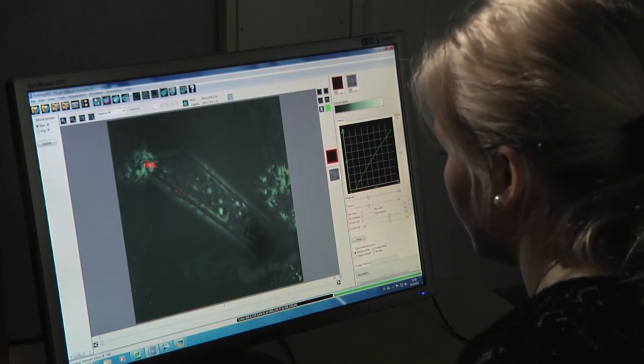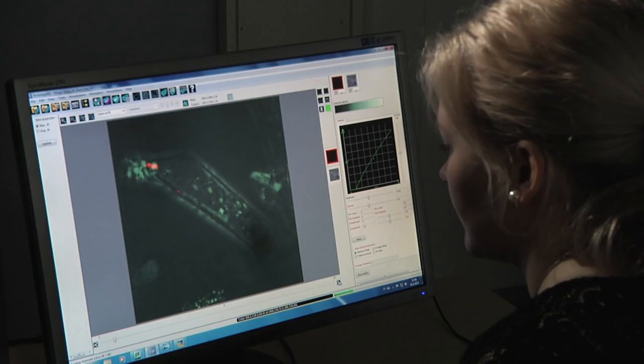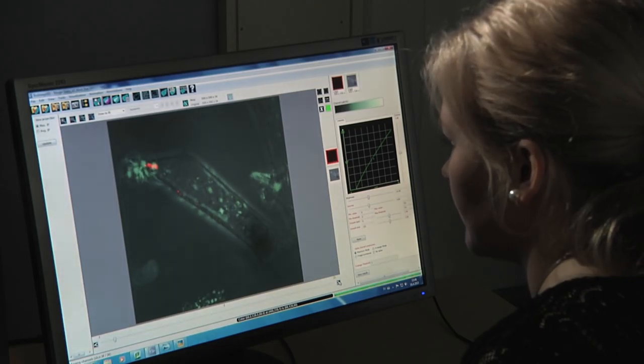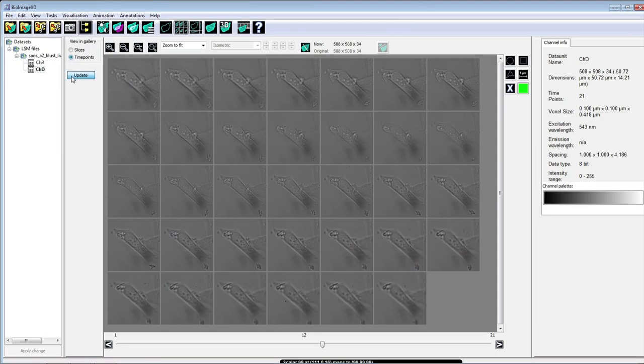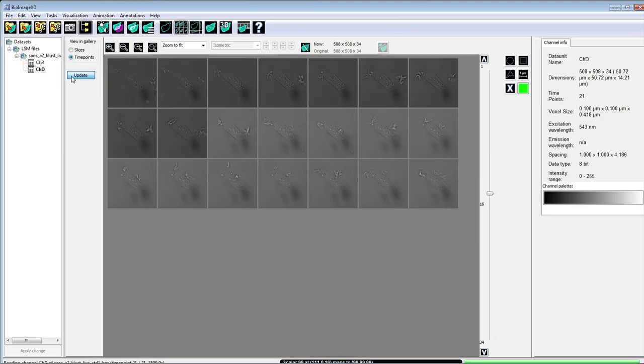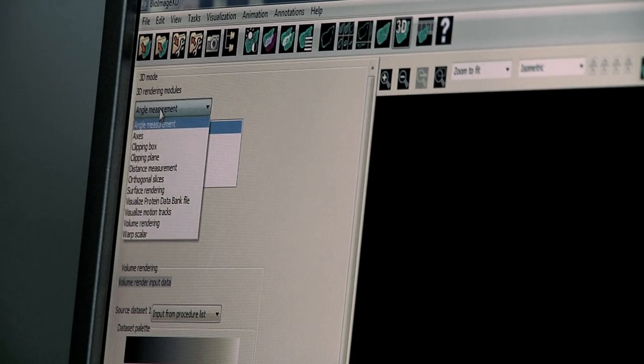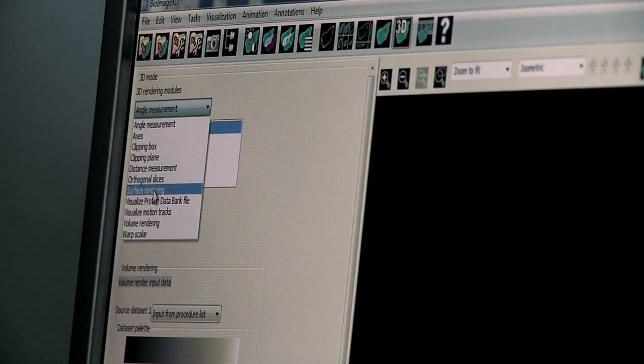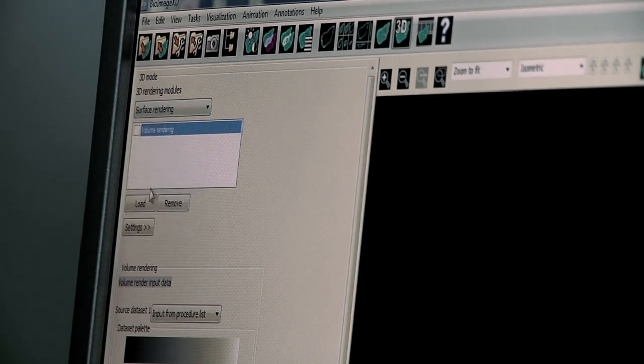And it has advanced visualization and animation features for visualizing your results. With advanced visualization modes, data can be observed very intuitively.